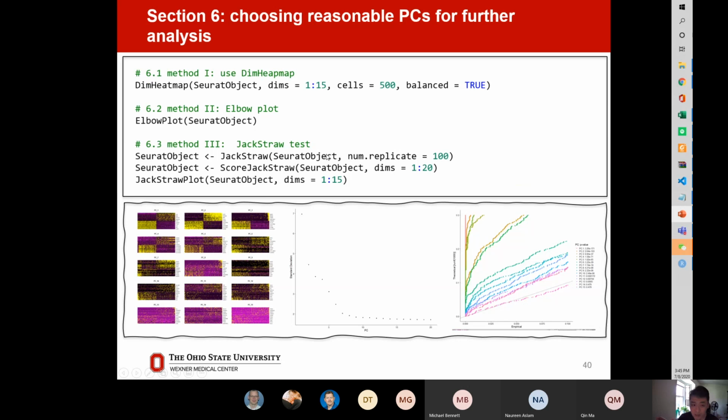So after running the PCA, we got a lot of pieces. It's a new dimension to interpret the data, but it's still high dimension. We still need to reduce those dimensions again, because in our mind, we can only imagine something in 2 dimensions or 3 dimensions. We cannot imagine how 4 dimensions look.